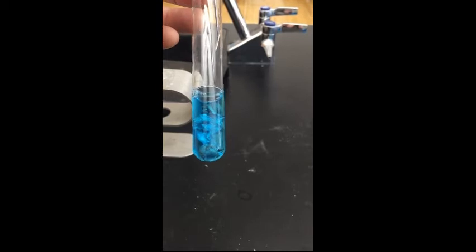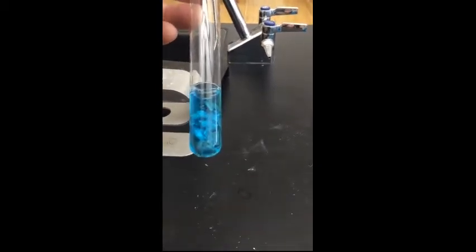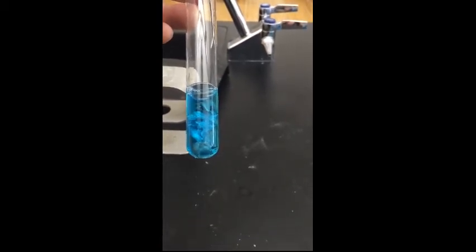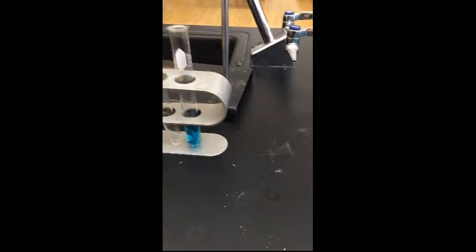In this reaction, the copper is replacing the zinc on the surface of the zinc. So we're going to have to wait a little bit for this. We'll come back and check the results of that.